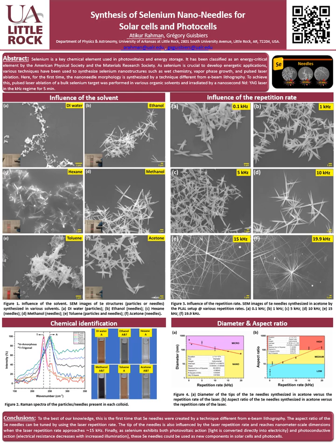From the first image, this is 100 hertz, and then 1,000, 5,000, 10,000, 15,000, and the maximum we can use in our laser is 19.9 kilohertz, so 19,900 hertz.